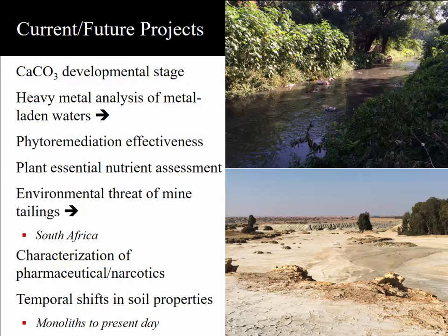So to illustrate how simple this technology is, I have actually borrowed David's machine several times, or I have collected samples and sent them to him. And just some examples: I had a representative from the company come out to teach me how to use the machine. As we did, we started on Strubles Creek before it reaches campus, and then just tracked it down all the way to the duck pond, and passed just to see if anything showed up.